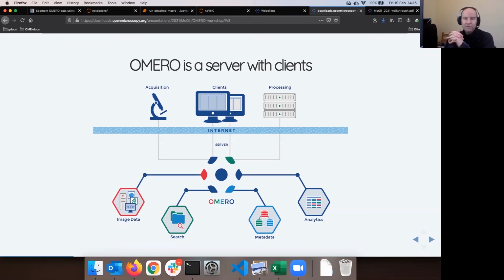I know that you maybe don't understand all these technicalities. I just repeat it here because it has to be clear for the people who are running or will run the Omero server at McGill. Okay, that is all on the plate of the institution hosting the server.